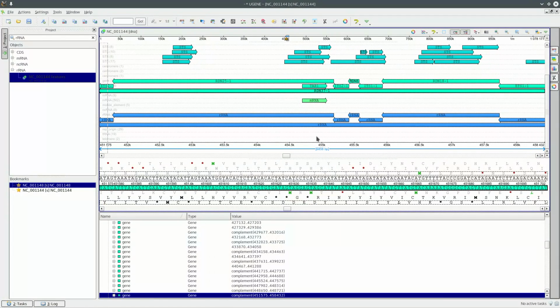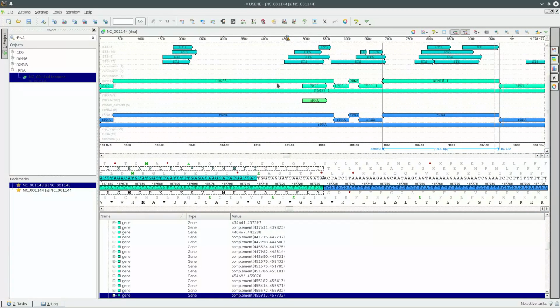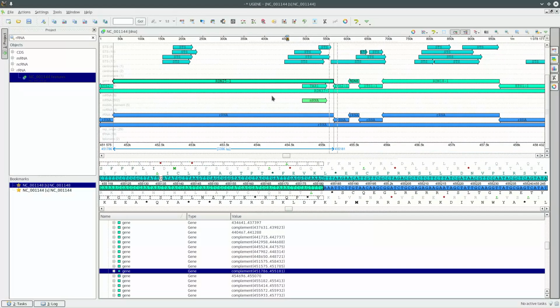This is a good time to explain why we're looking at the yeast reference genome when we're interested in identifying the species type of unknown wild yeast. This is due to the nature of the ribosomal genes. Some of them are very highly conserved throughout all yeast species, and others are highly divergent throughout all yeast species. Ribosomes are an essential piece of cellular machinery that's involved in protein synthesis. Some of these genes encode structural members of ribosomes, and others do not. For instance, the genes RDN18 and RDN25 encode for structural members of the ribosome.